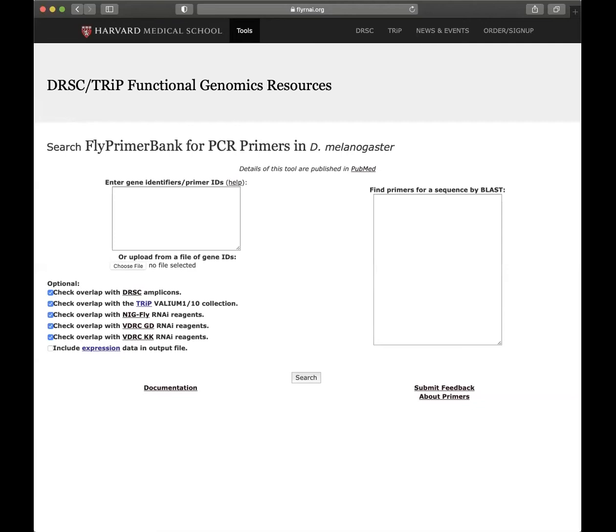I will be introducing you in this demo video to the FlyPrimerBank online resource, a database of pre-computed primer designs for quantitative real-time PCR, which is commonly called qPCR.